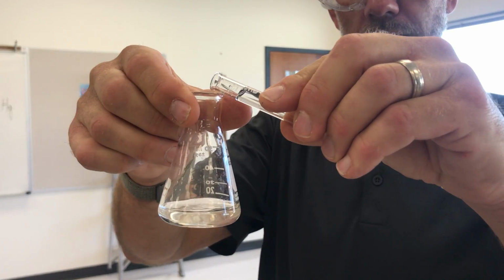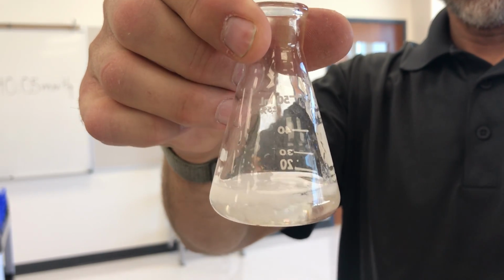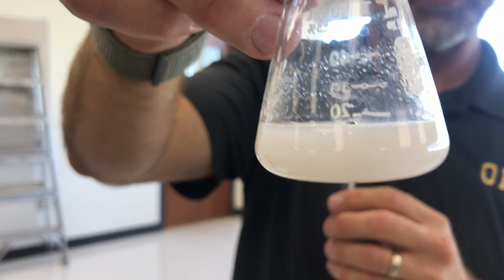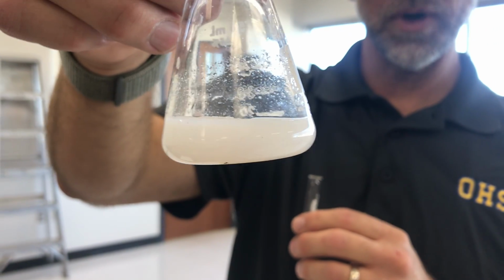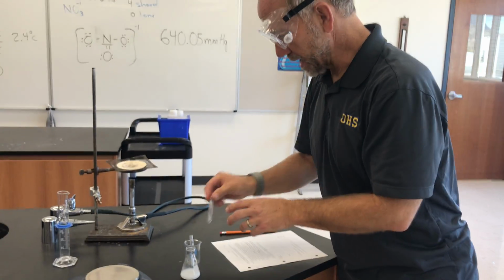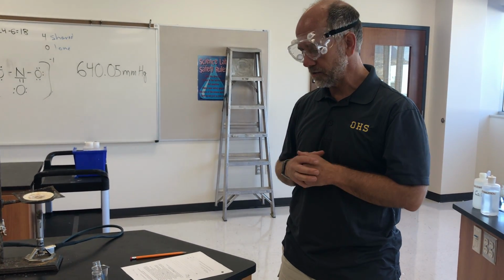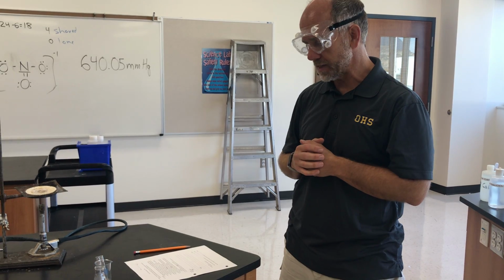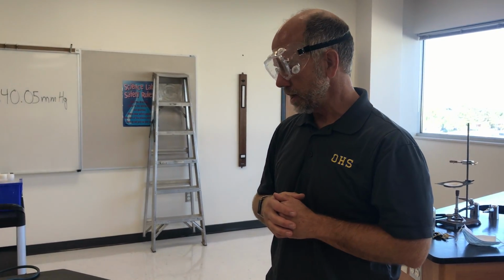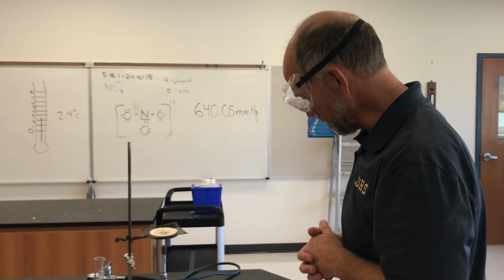So, is that a good angle? Mm-hmm. So as we pour these together, and then swirl. You'll notice that we end up with a white solid that is formed from that chemical reaction. At this point then, take a second, pause the video if you need, and write down any qualitative observations under step 5 there in the data chart. And the thing that you're looking for, as you learned in the introduction, is that we're looking for evidence of a chemical change.